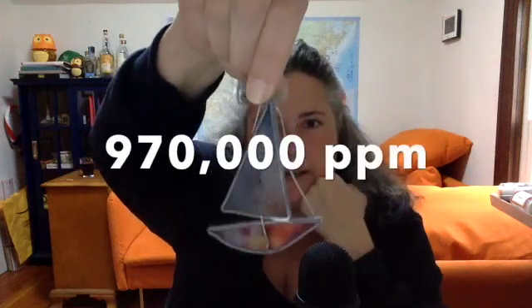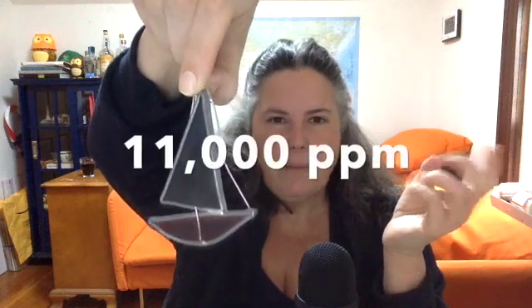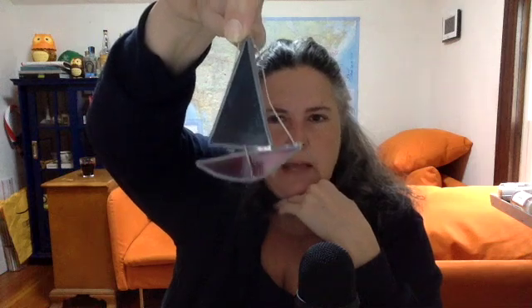When this was tested with an XRF instrument, it came in at about 970,000 parts per million lead in the coating, in the exterior. The remaining bit was a chunk of antimony — which is also toxic, causes cancer in rats, and disrupts biological systems — at about 11,000 parts per million. I'll be doing a post on the blog about this, but these things are generally quite toxic and dangerous and shouldn't be handled.